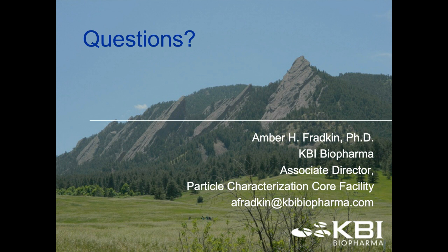Again, looking at filters that one may use in administration can drastically impact particle profiles. Can help you reduce those. Can help mitigate some of the particles coming out post administration, as well as the containers being used. Certainly, no container is particle-free, I will say.